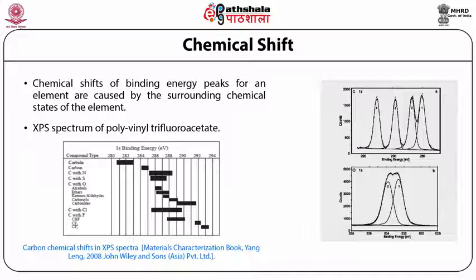PVTFA. The carbon atoms in different environments generate distinctive peaks as shown in Figure 1a.